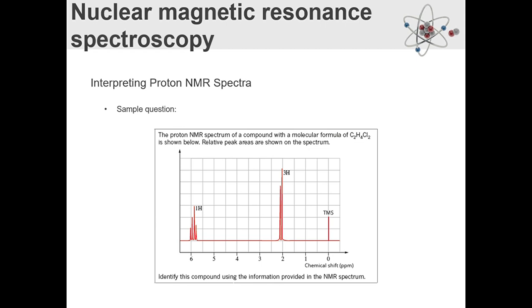All right, here's your hint. The molecular formula of the molecule is C2H4Cl2. What you can do is you can actually work out already what the only 2 possible molecules are for C2H4Cl2, and then you can try and work out what splitting and integration would look like for those 2 peaks. Again, I'm going to stop talking to let you pause it.